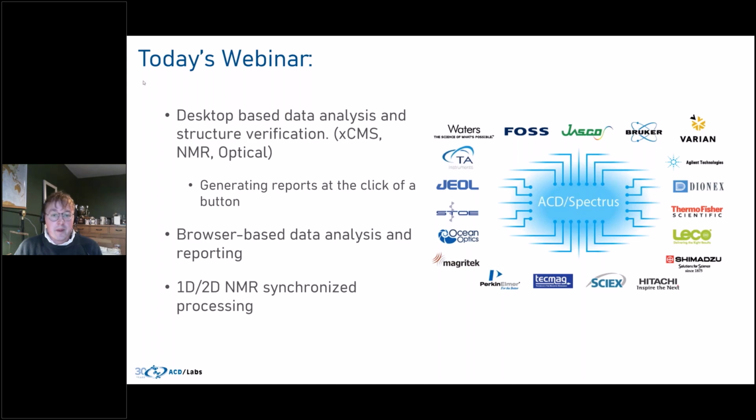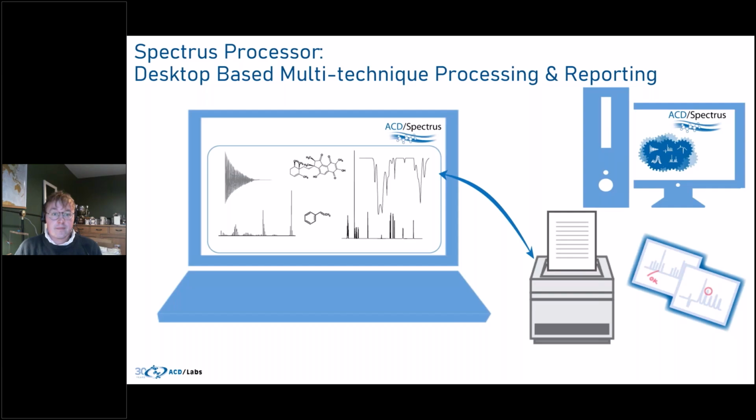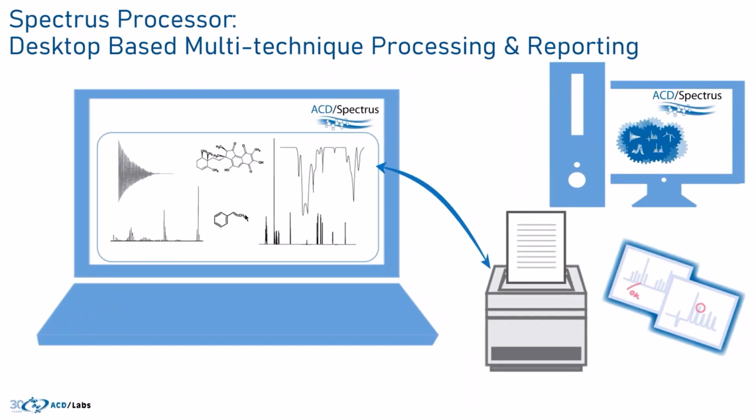Okay, just bear with me while I share my screen again. Okay, so hopefully everybody can see my screen and they can hear me talk. So let me turn off my webcam so we can just focus on the data shown.